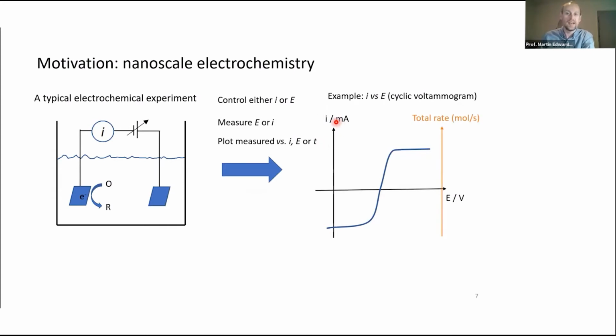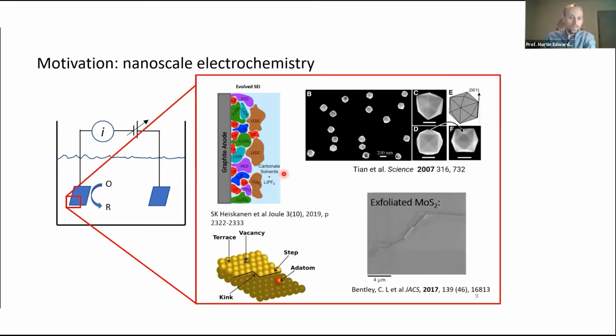As I said, we're measuring the current, but we can relate that to a reaction rate over the whole surface of the electrode. But that's really equivalent to measuring an average rate. So if we just divide through by the area, we're learning something average about a chemical process. But real electrodes are never just one thing.